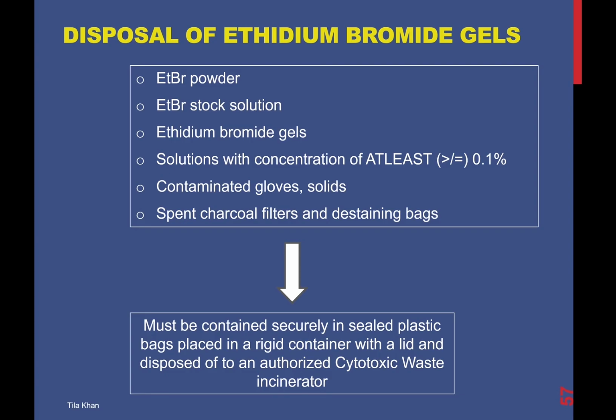So if you have ethidium bromide powder in your lab, or an ethidium bromide stock solution, or ethidium bromide gels, or solutions with a concentration of 0.1% or more of ethidium bromide, and you have contaminated gloves or solids that came in contact with ethidium bromide, or spent charcoal filters or destaining bags that were used for filtration of ethidium bromide, then all of these categories have high amounts of ethidium bromide, and this cannot be thrown in the regular trash.